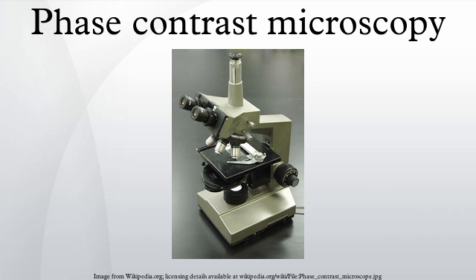Working principle. The basic principle to make phase changes visible in phase contrast microscopy is to separate the illuminating background light from the specimen's scattered light, which make up the foreground details, and to manipulate these differently. The ring-shaped illuminating light that passes the condenser annulus is focused on the specimen by the condenser. Some of the illuminating light is scattered by the specimen. The remaining light is unaffected by the specimen and forms the background light.